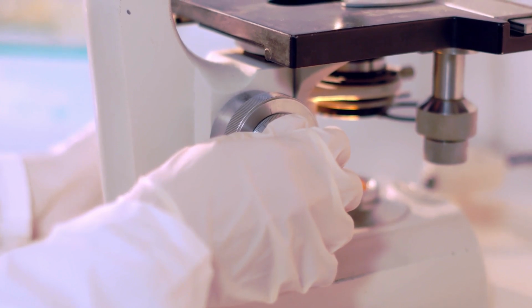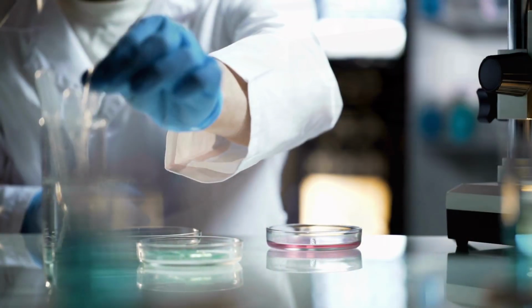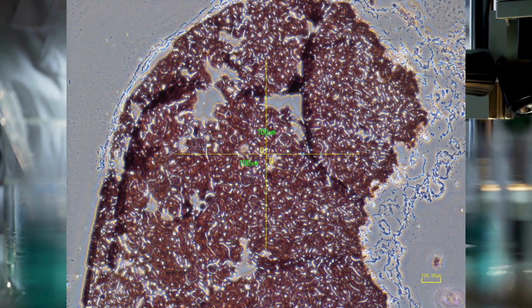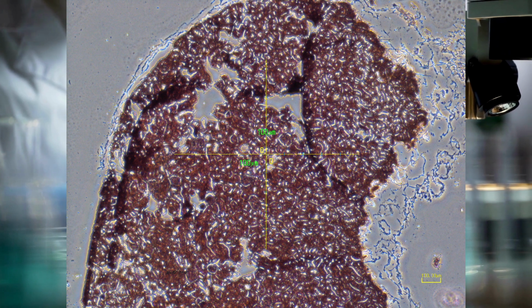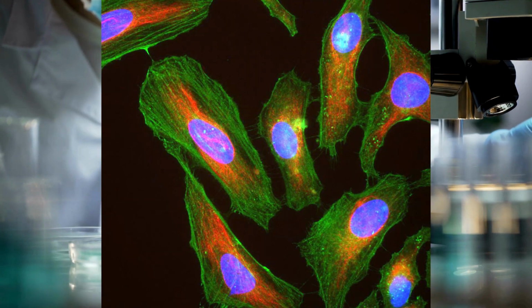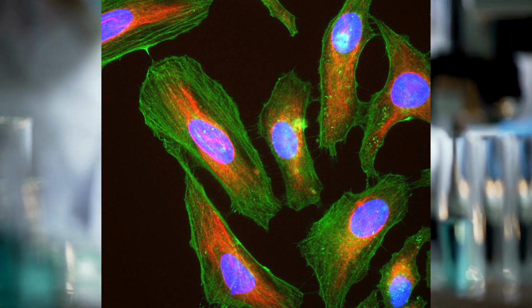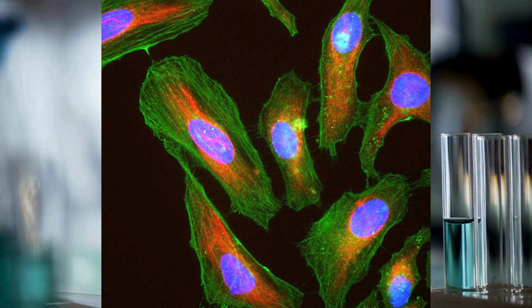Let's start with a simple example that should help to understand what and how this is useful. Let's say you have a cell. This cell is part of an experiment to understand how a certain thing acts, for example, a movement of a protein. And by adding a small marker to the protein in the form of a fluorophore, or something similar, the thing that you're interested in will glow. Well, typically it will glow if it's added to the same place as the protein, since it is part of the protein now. Either that or it's become attached to it.